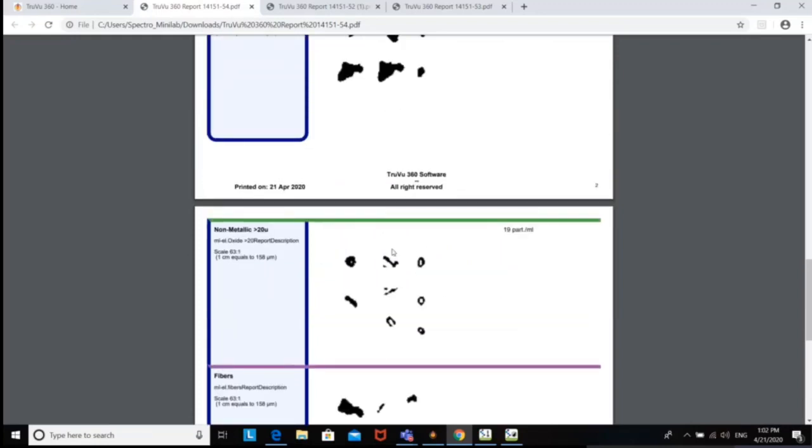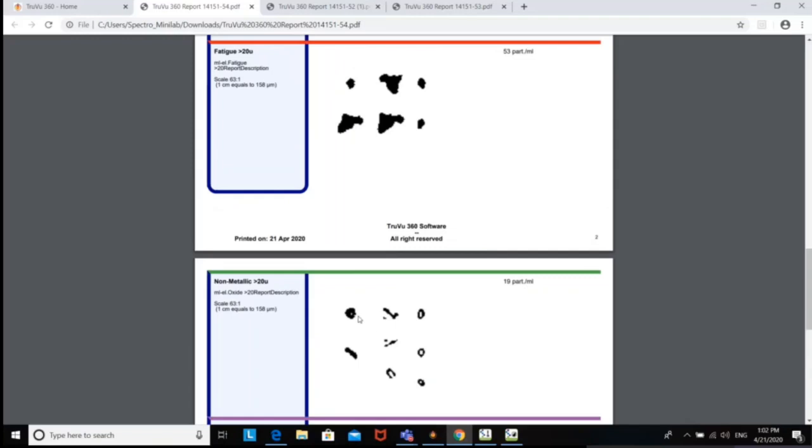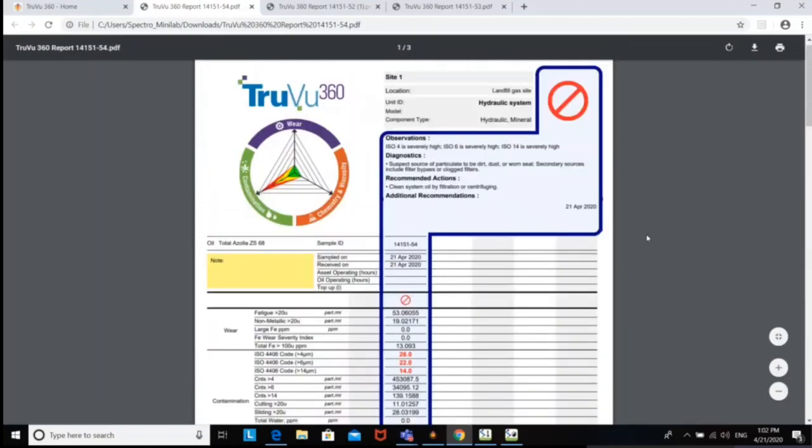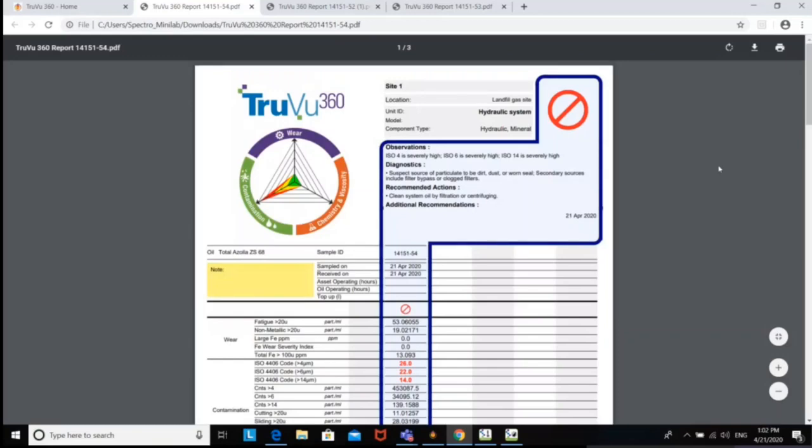The reason it can tell dust from metal particles is you always get a translucent. This would be the silicon crystal. The laser light can get through it, so you see this sort of translucent part. And there we have it. That is immediate diagnosis done in a few minutes on site with recommendations, actions, etc., etc. I hope you enjoyed it. Thank you.